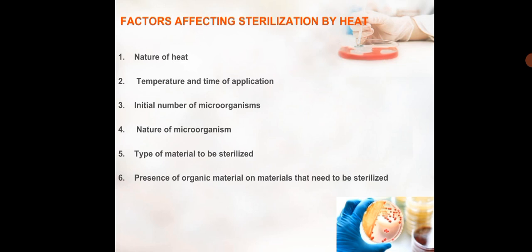Factors affecting sterilization by means of heat include nature of heat, temperature and time of application, initial number of microorganisms, nature of microorganisms, type of material to be sterilized, and presence of organic material on materials that need to be sterilized.